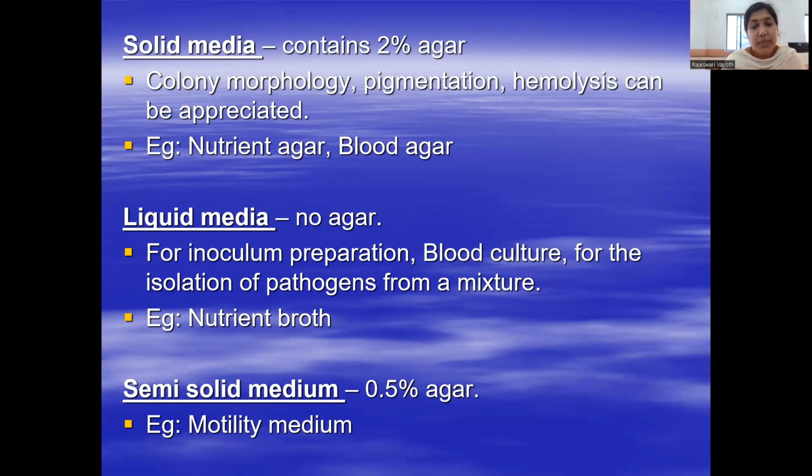Semi-solid medium contains 0.5% of agar. It is mainly used for checking the motility of bacteria.